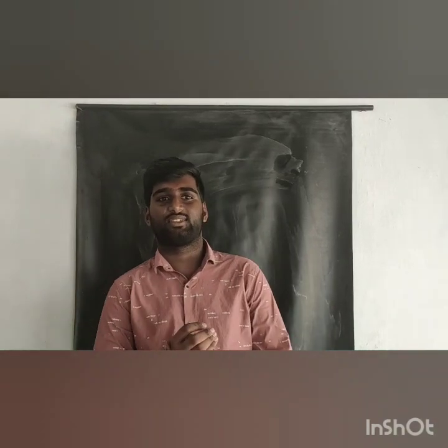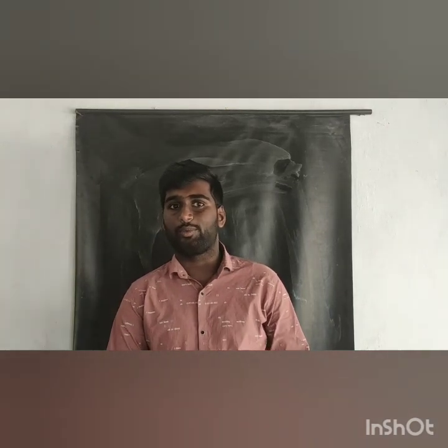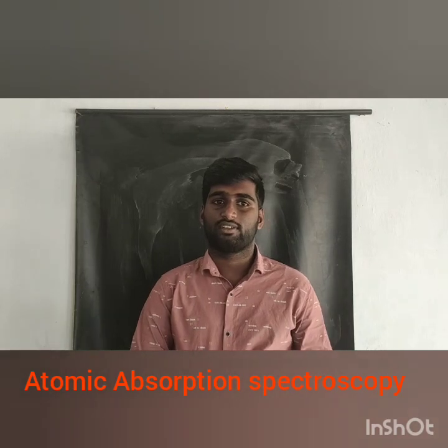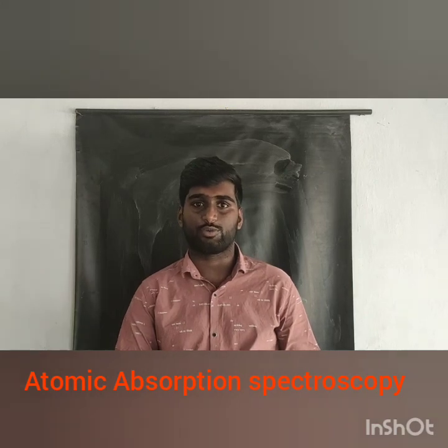Hi friends, good morning to one and all. In the previous class I taught about spectroscopy techniques, about atomic absorption spectroscopy up to the principle. So today we will continue the topic. I want to teach today the instrumentation of atomic absorption spectroscopy.